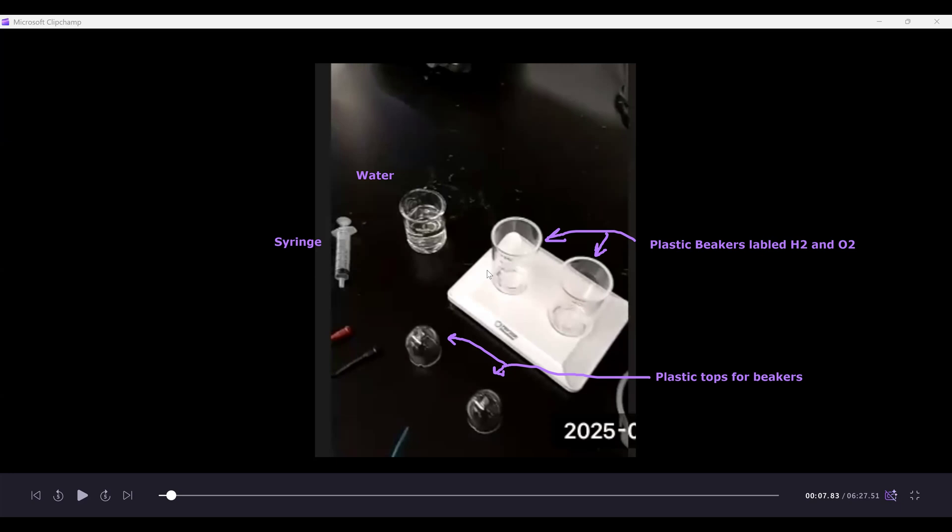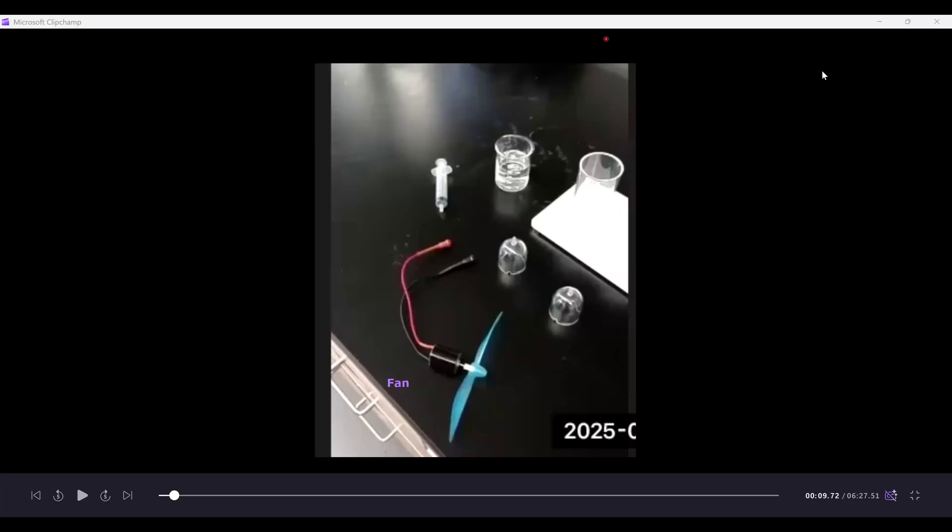We have water that we're going to add to the beakers, and a syringe for adding water to the fuel cell. The last component is the fan, which is used to see how long we can run it based on the amount of hydrogen and oxygen gas collected. So those gases produce electricity to run the fan. These are all the different components of the fuel cell apparatus.